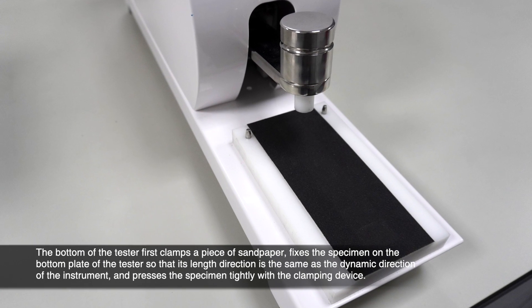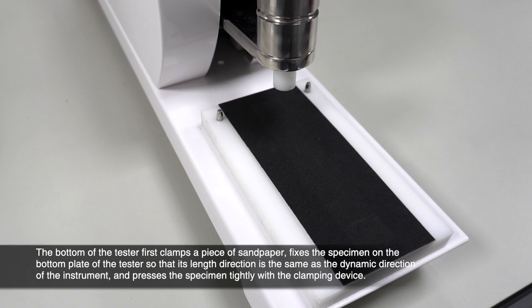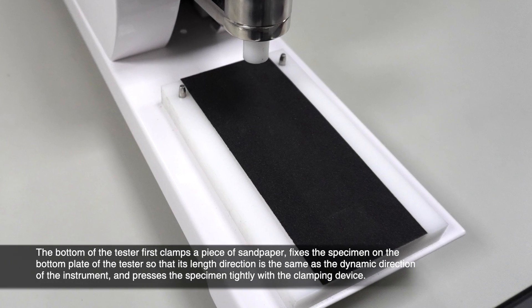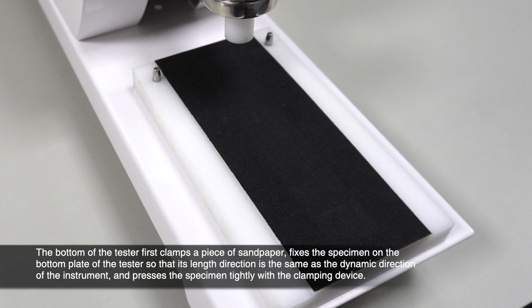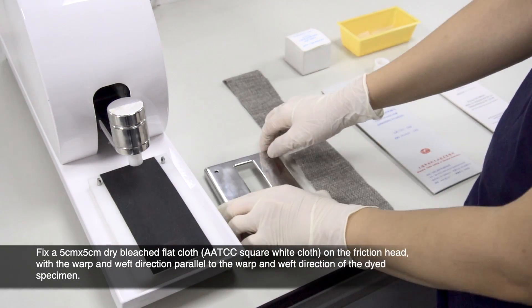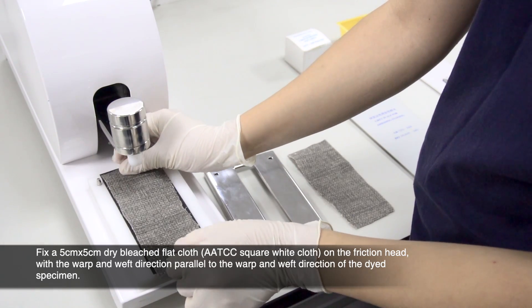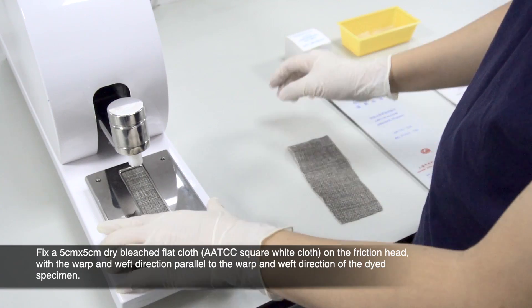The bottom of the tester first clamps a piece of sandpaper. Fix the specimen on the bottom plate of the tester so that its length direction is the same as the dynamic direction of the instrument, and press the specimen tightly with the clamping device. Fix a 5cm x 5cm dry bleached flat cloth on the friction head with the warp and weft direction parallel to the warp and weft direction of the dyed specimen.